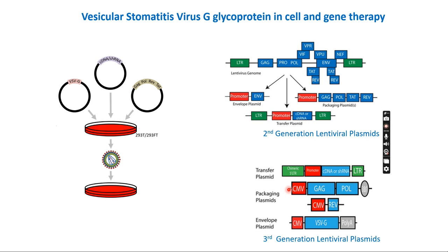Even though we use safer second generation or third generation lentiviral packaging systems, it is still important to ensure there is no leftover genetic material from lentiviral vectors that could actually lead to a secondary cancer or other complications, which is unwanted.